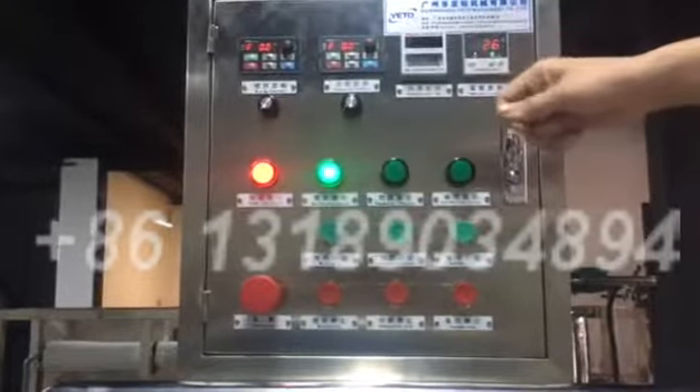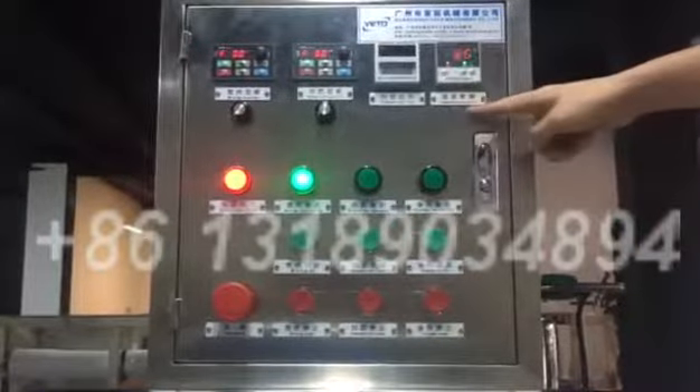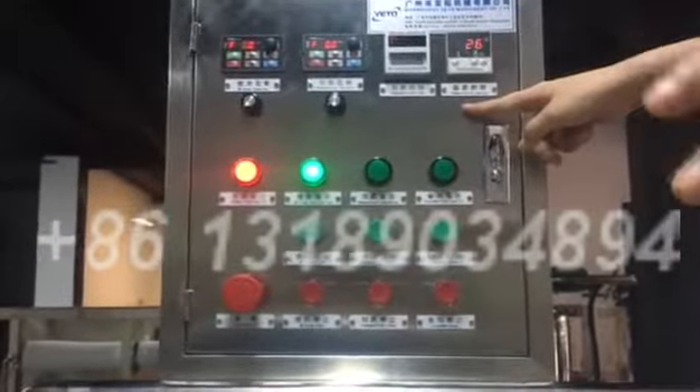This is the single layer — there is no heating. This is just to show you the temperature inside the tank.